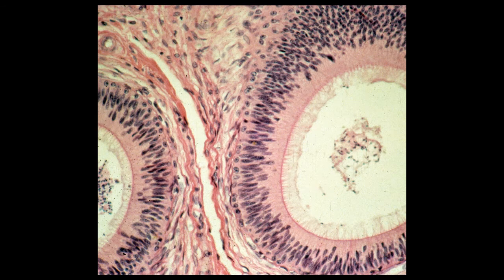This is a profile through the epididymis. The epididymis, of course, is in the male reproductive tract, and this is a pseudostratified columnar epithelium, and these epithelial cells possess a surface specialization called stereocilia. The stereocilia are seen like this. Stereocilia are essentially long microvilli.